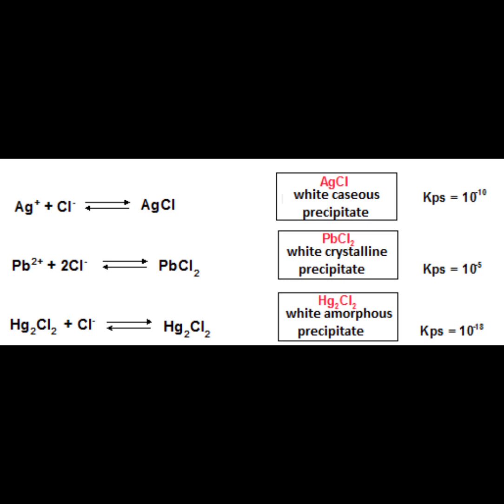Then, which is the concentration of chloride ions that makes the precipitation quantitative? Then it follows that, and so a concentration that without any doubt hydrochloric acid, a strong acid completely dissociated in water, guarantees.